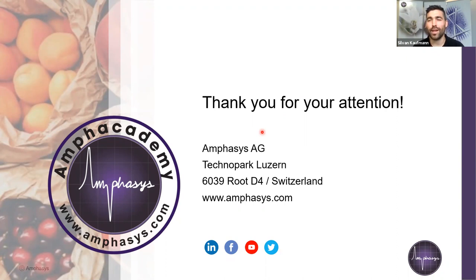And then you go there and you collect those stigmas in the field directly right after pollination. So the collection and measurement should take place right after pollination. You don't want pollen tubes to grow down the style already, because in the end, we need to retrieve those particles from the stigmatic surface. So what we recommend is going to the field, cutting those stigmas, putting one stigma in one Eppendorf tube. You go back to your instrument, you add a bit of buffer to your sample, you shake it to release all the particles from the stigmatic surface, and then you do your measurement with the counting mode.